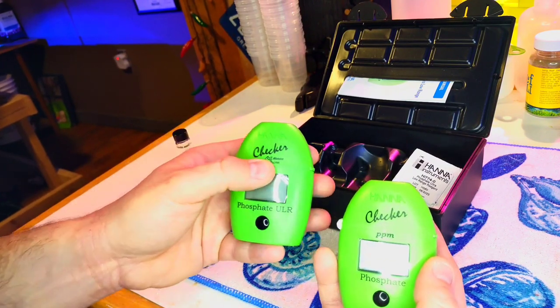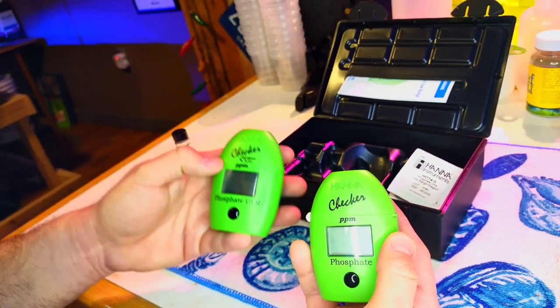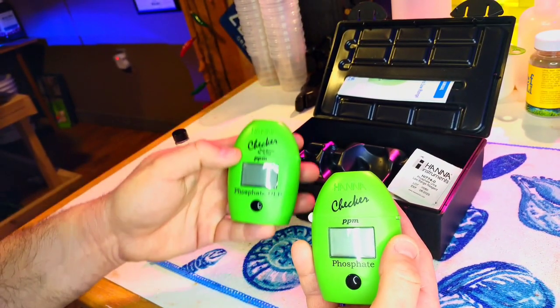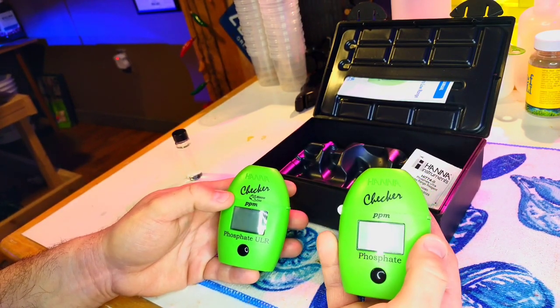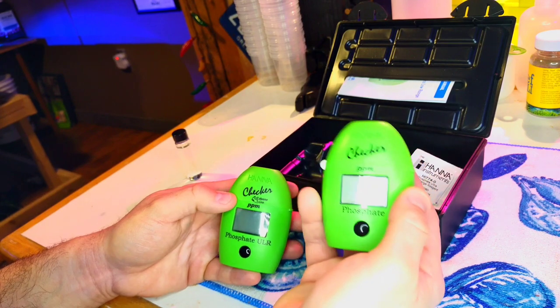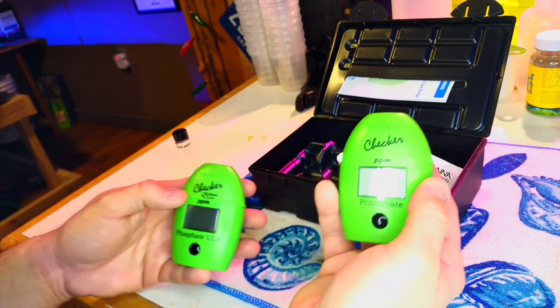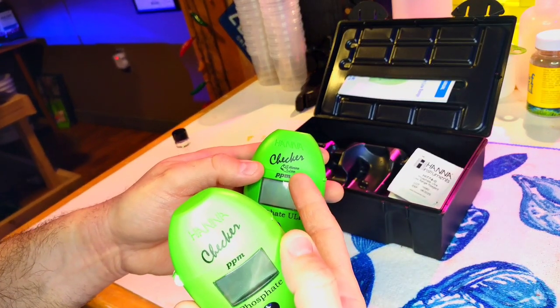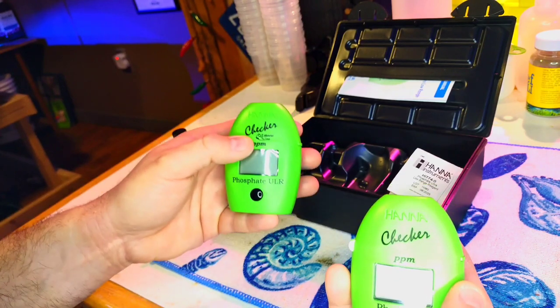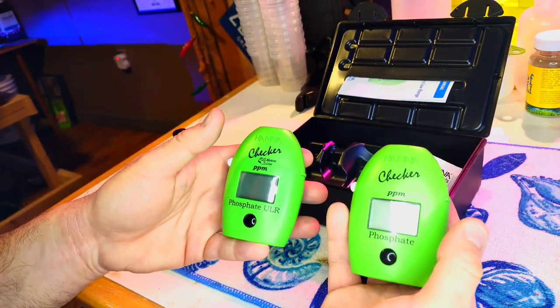If you notice, it says 'marine line' on the top. That gives you the clue that these are the ones used for saltwater tanks. Hanna does make other checkers that are not for saltwater at all. Look for the marine line label — that'll let you know for sure it will be good for saltwater tanks.